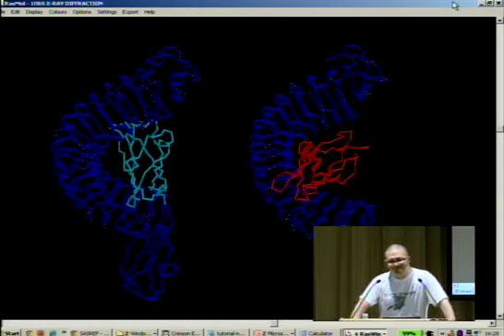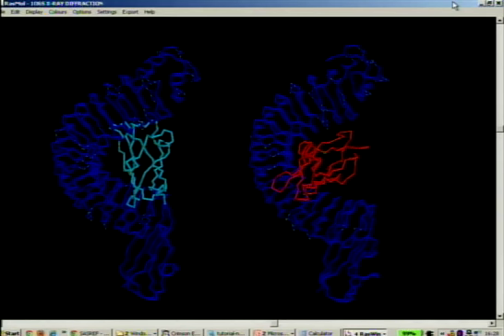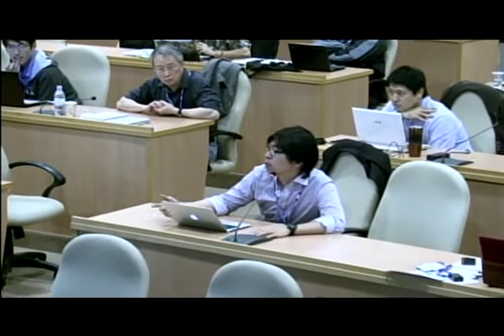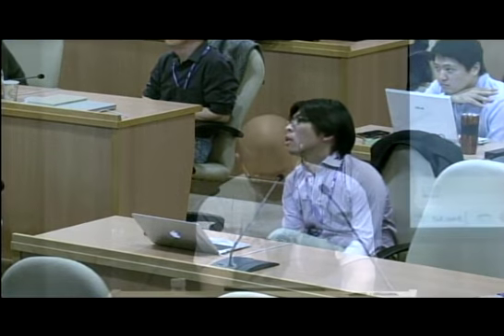Yes, please? For the contact information, you showed that you can define residue pairs. But that's just one entry, right? Say, for example, if I have biological data, so I know one spot is interacting with the other side, but I would like to have, say, a few more kind of restraints. Is that possible? So yeah, basically, so let me see if this works here.